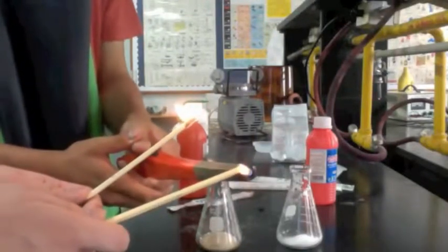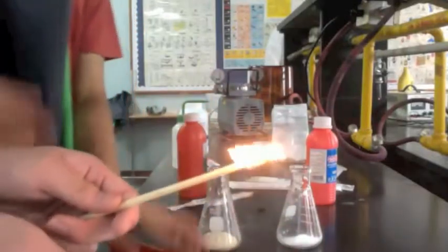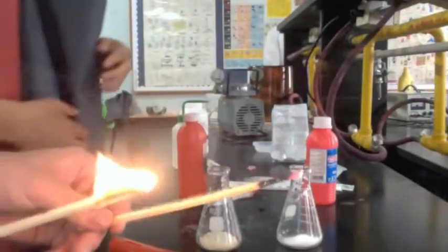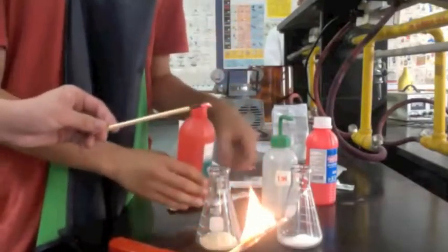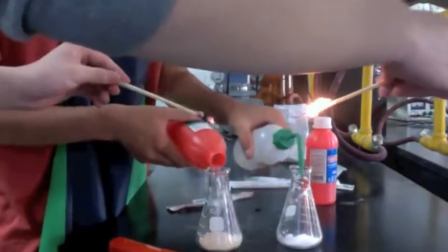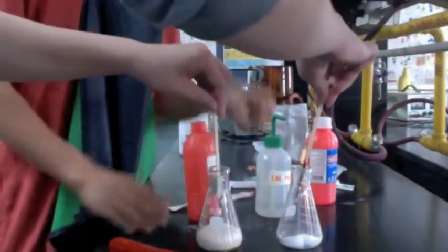We're going to leave one of them in an open flame and then partially blow out the other one, just so as to leave it as a mere ember. So we blew out but left just enough flame for it to ignite later when we pour hydrogen peroxide into the dry yeast to produce oxygen. And now we're going to start mixing the two flasks. So again, the flask with the sodium bicarbonate we're going to mix with hydrochloric acid to produce carbon dioxide, and the flask with dry yeast and hydrogen peroxide will produce oxygen.